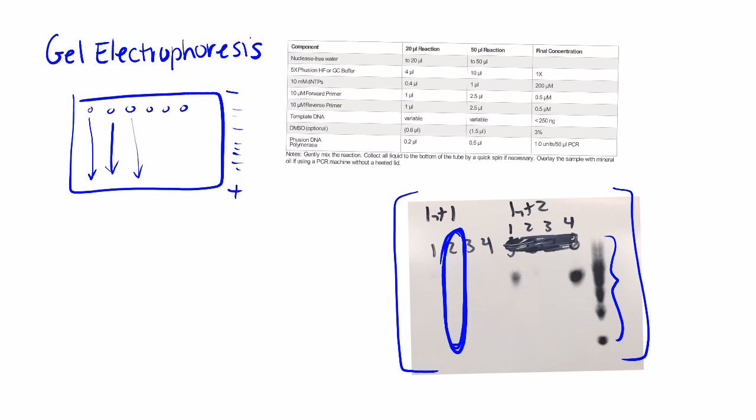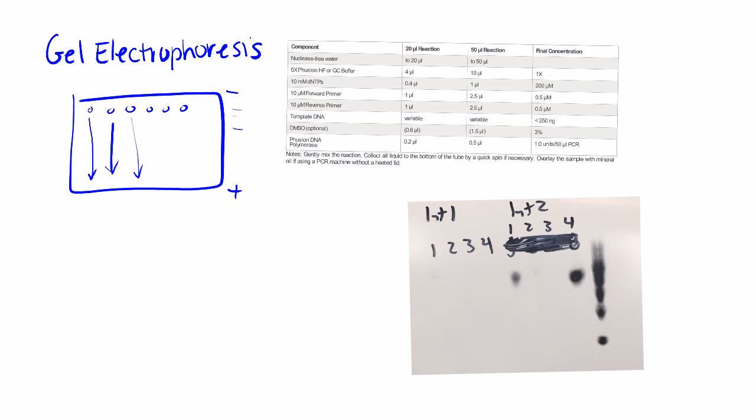But it's okay, because we can try again, we can try to reduce our human error, we can try to make sure that our gel electrophoresis is working properly, and once it does work properly, we will continue on our process of using PCR for transformation.